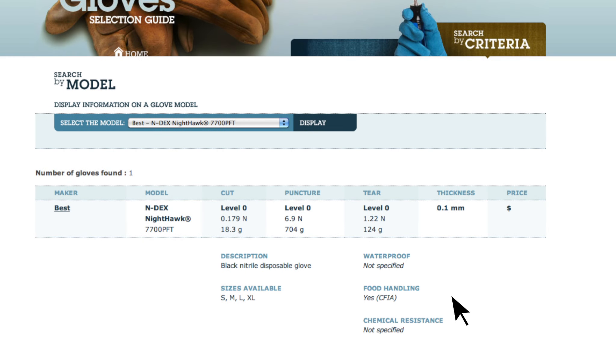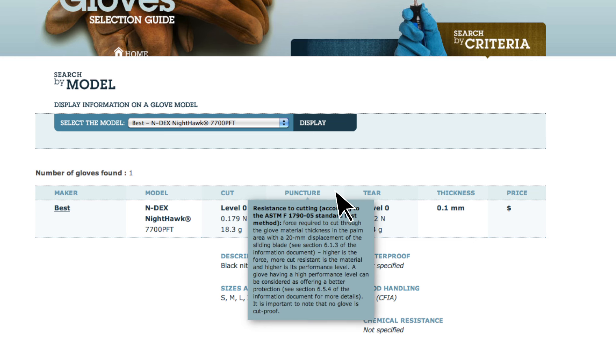It is important that the user refers to the manufacturer for the complete specifications of the glove. Also, by scanning the tabs with the mouse, a description of the item appears.